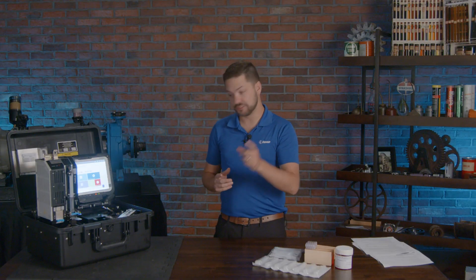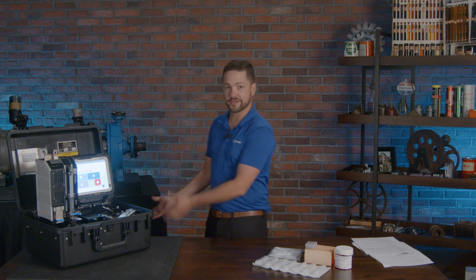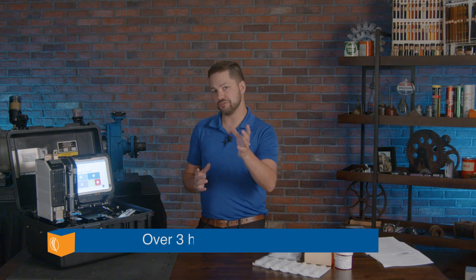Another thing is the power. I was able to turn it on without it being plugged in. I went ahead and plugged it in, but I didn't need to. This has two to four hours of battery and can easily suffice for what you need in your environment.